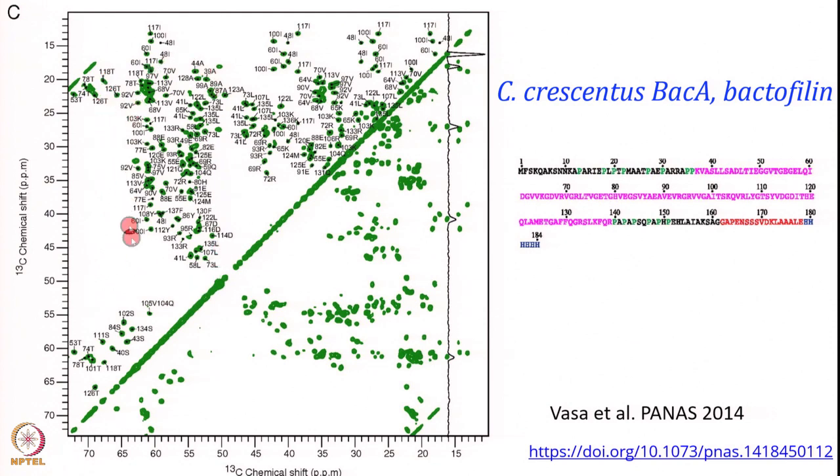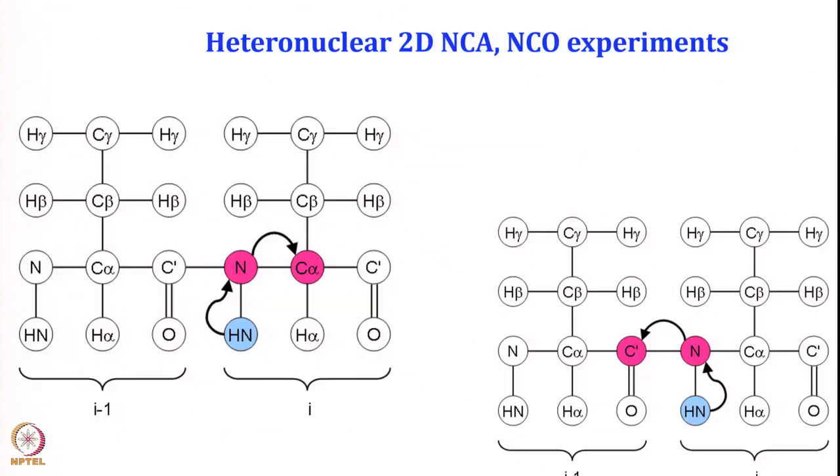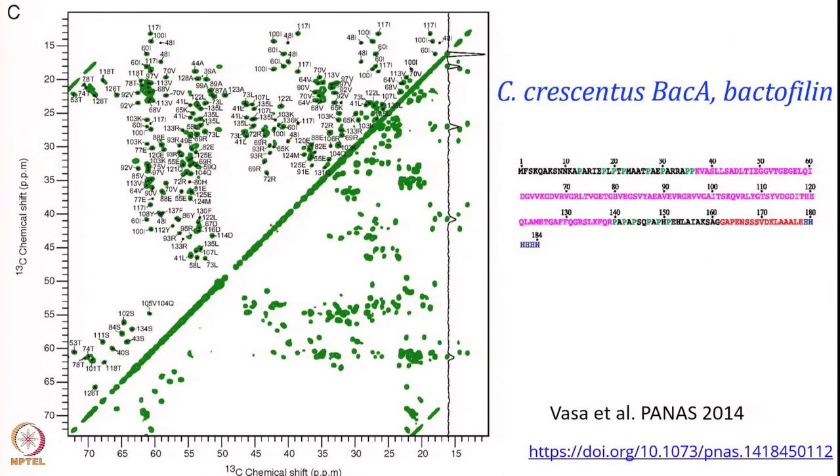So, all these correlations one can easily establish from C alpha to C beta to C gamma to C delta, here C beta to C gamma, C delta, here are deltas, delta can also be shown here, like you can see all the way going from top to bottom. We can do spin system specific resonance assignment or near neighbor assignments by doing this. This is a beautiful spectrum and can be used for starting the assignment. But that is not enough, this was only a carbon-carbon spectrum.